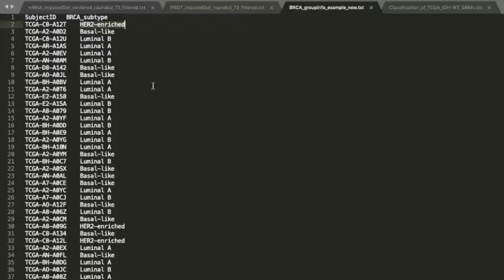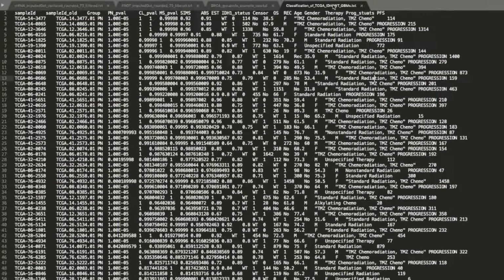For each sample ID listed in this file, multiSLIDE searches for a matching column in the data files. Therefore, the sample IDs must match across the two input files and this file. In case a sample is missing from a particular input data file, its expressions will be visualized as missing values.